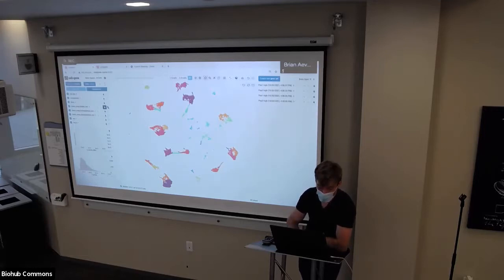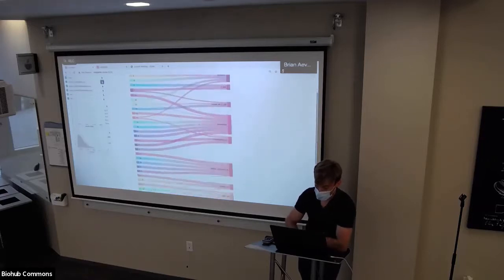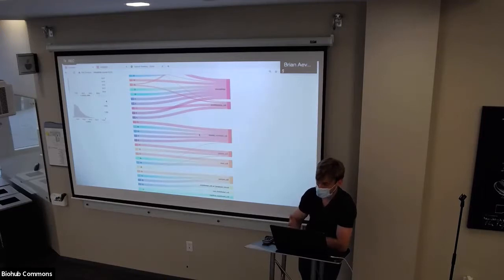And the way I do this is you have these checkboxes here. You can select a category. I'm selecting the leiden clustering. I'm also selecting the cell types. And then it unlocks this button here. You can display a sankey plot from your selected categories. So now we have a sankey plot that's showing me the connectivity between leiden clusters and the cell types.